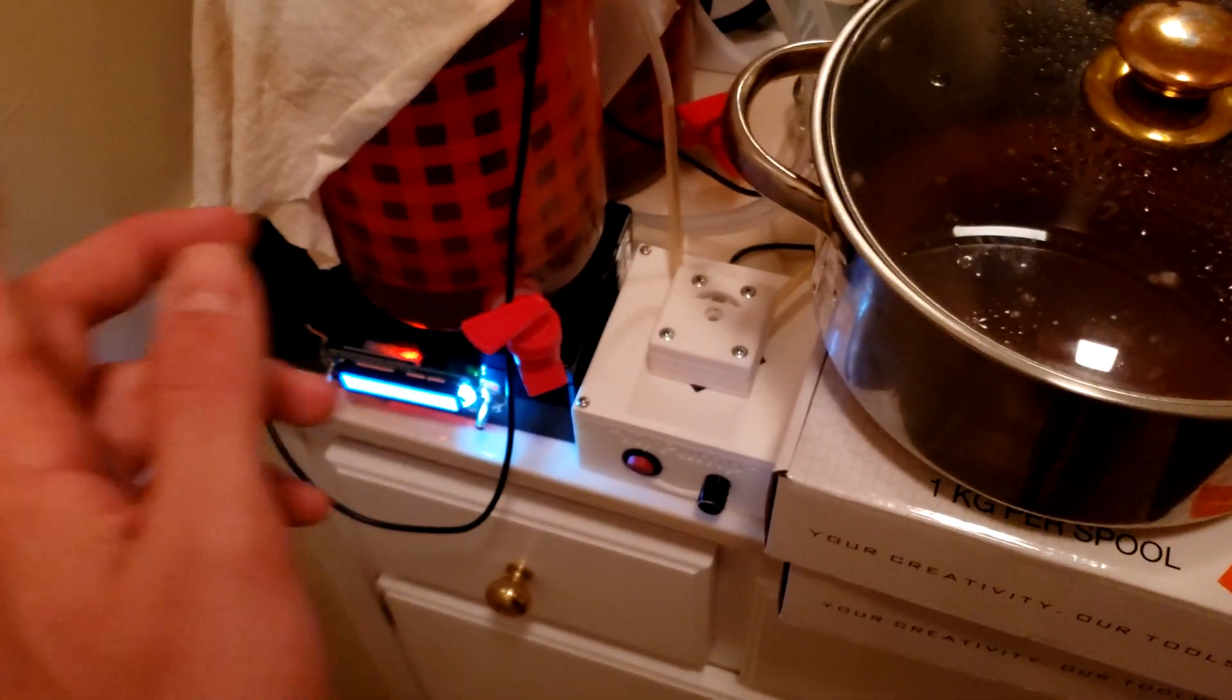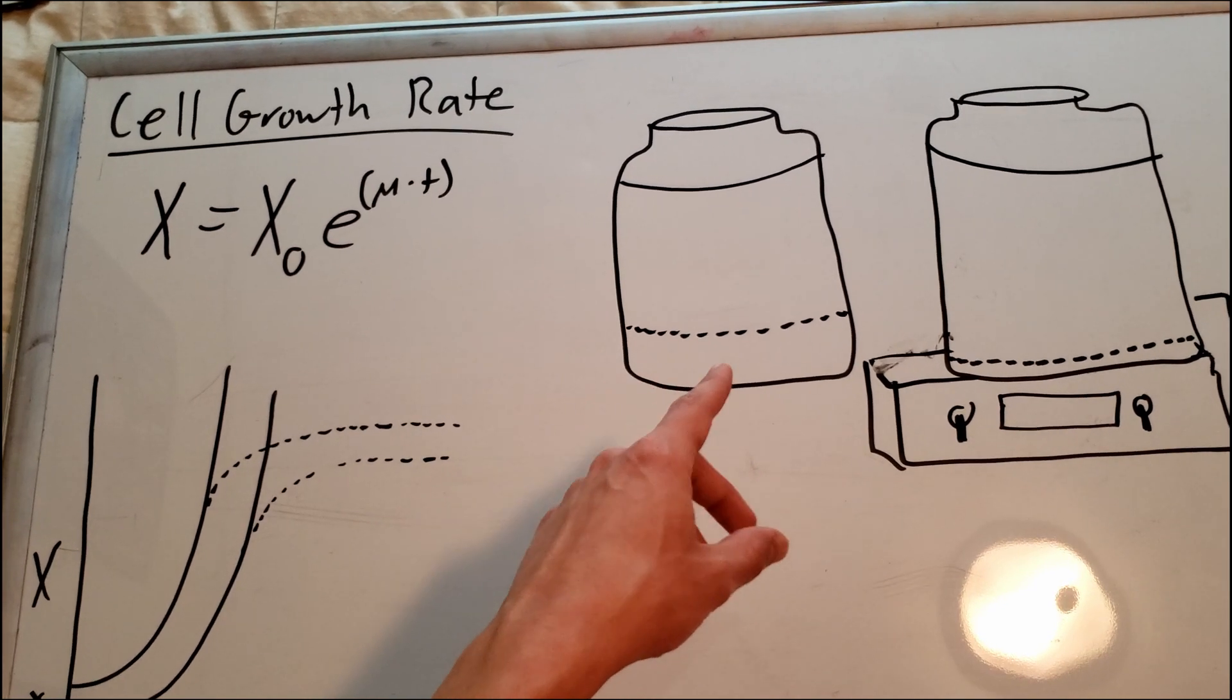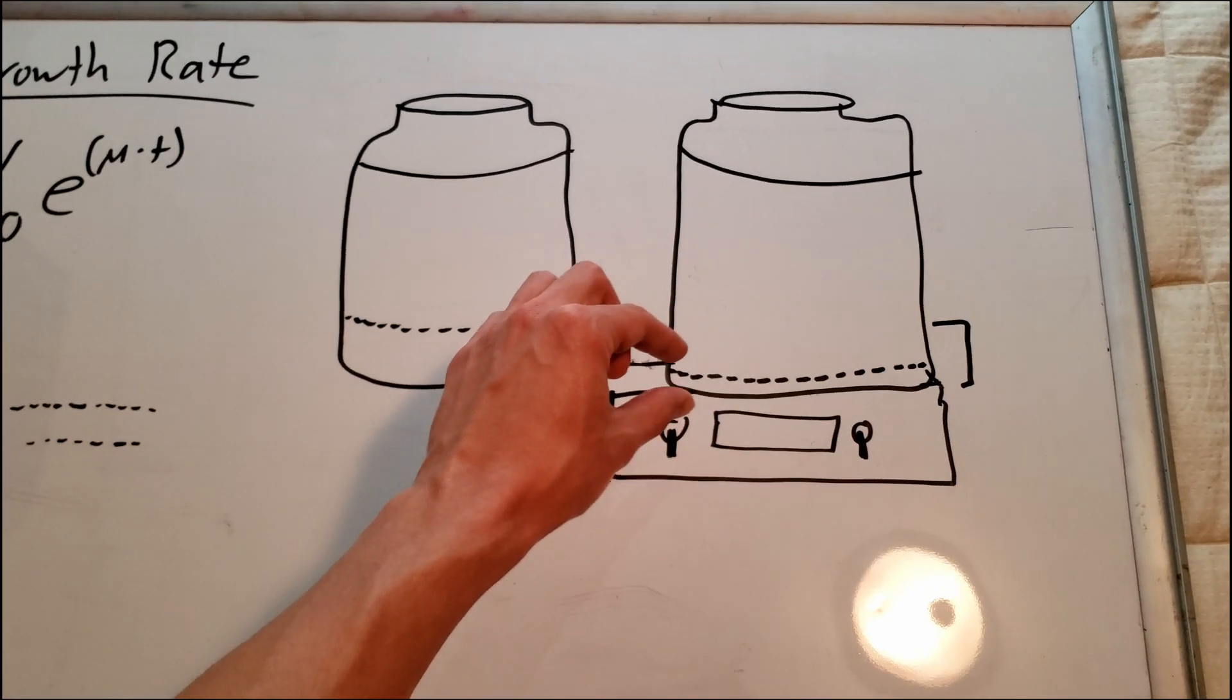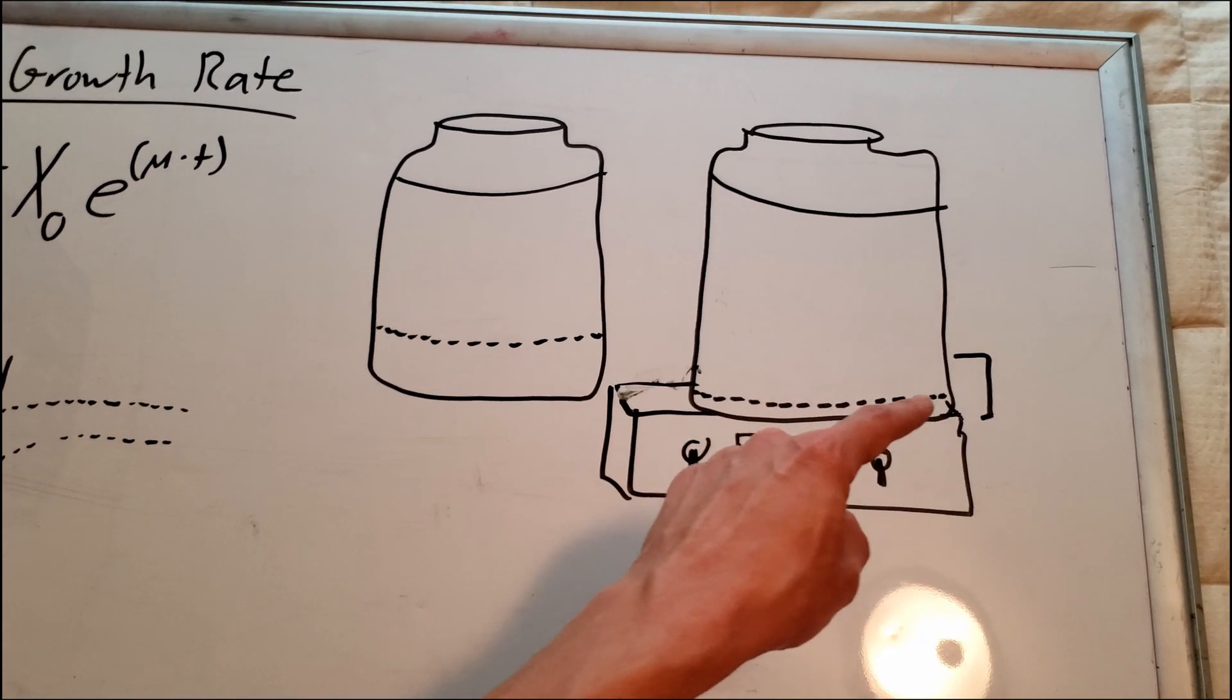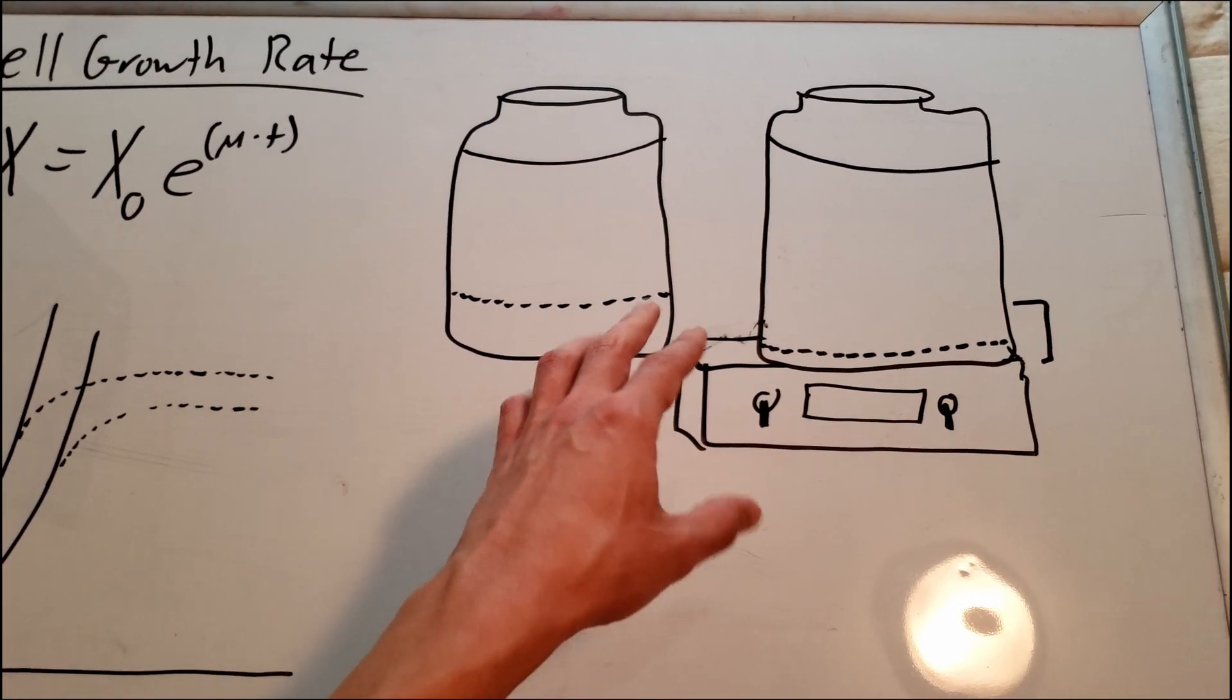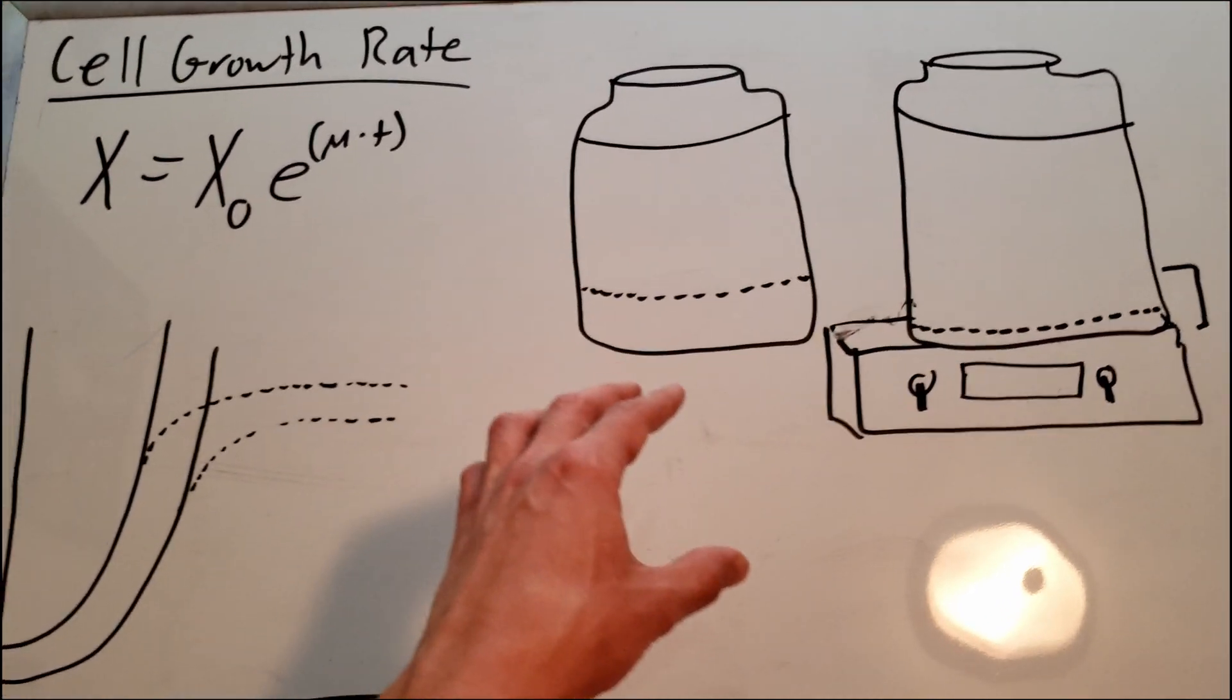The other issue is a little bit more complicated. I'll explain it on the whiteboard. So what happened was I started with this batch reactor, which started with about 20% starter culture. And then what I did is I took about 10% of this and put it into this tank. So that's what this bracket here represents. And what this dotted line is is the actual amount of starter that the fed batch reactor would have received. So very roughly it received about one fourth of the starter solution that I gave the batch reactor.